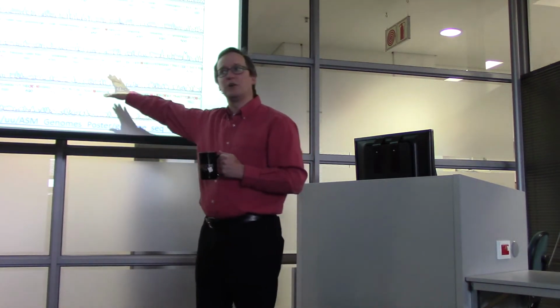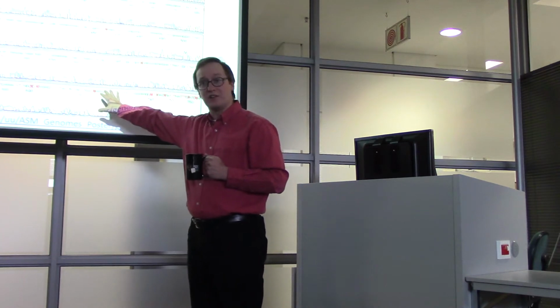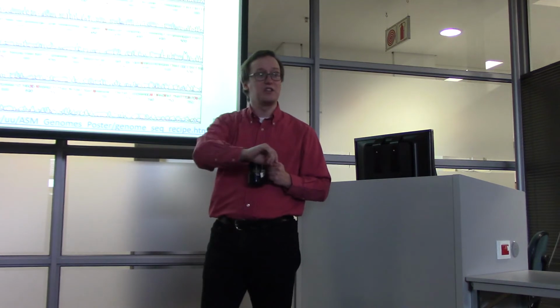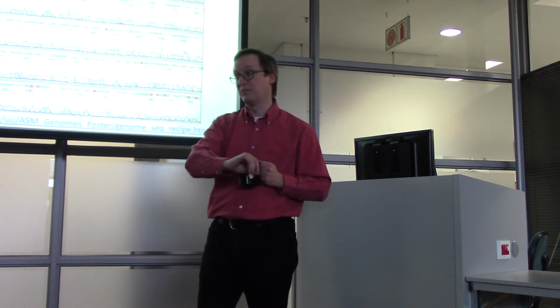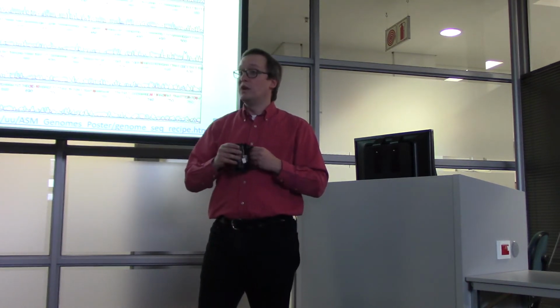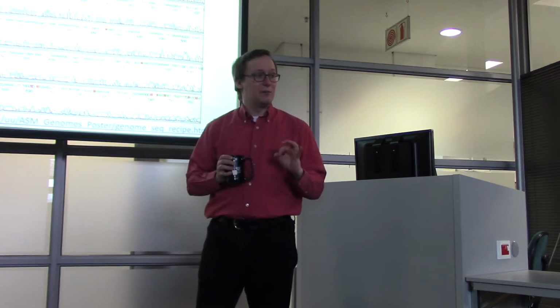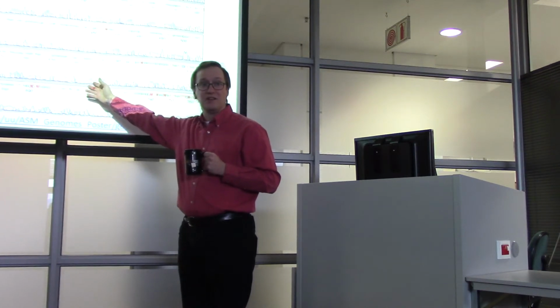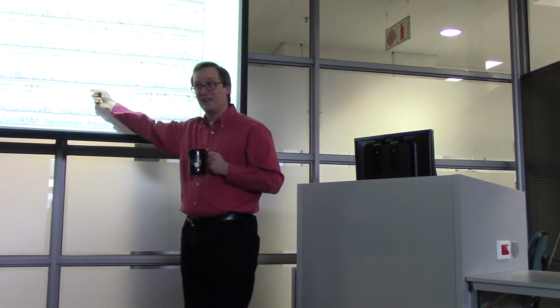Now, just because I'm showing you an electropherogram from a Sanger sequencer does not mean that the way that we do this now with next-gen sequencers is any different. However, in typical sequencer operation, we do not collect electropherograms anymore with next-gen sequencing because these data are big.